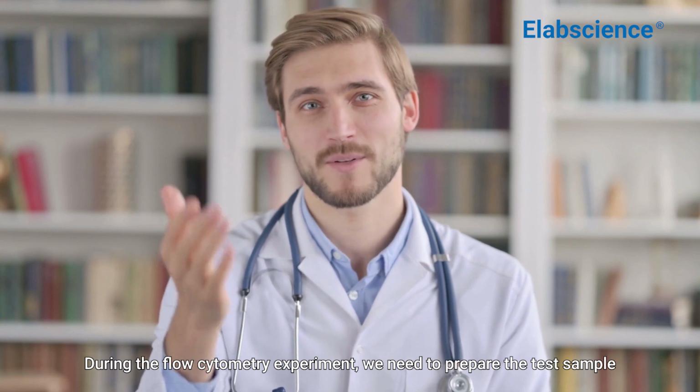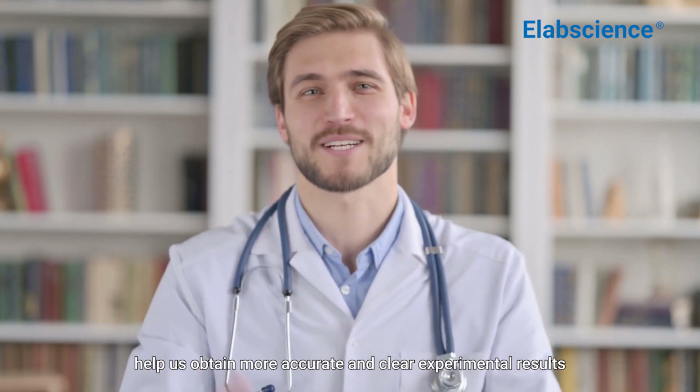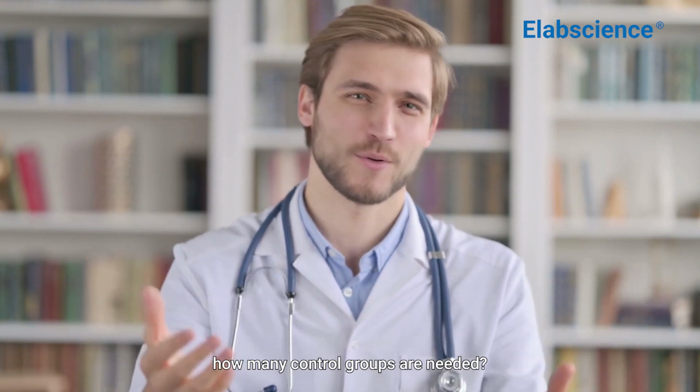During the flow cytometry experiment, we need to prepare the test sample. Meanwhile, different control groups also need to be set up to help us obtain more accurate and clear experimental results. In a flow cytometry experiment, how many control groups are needed?